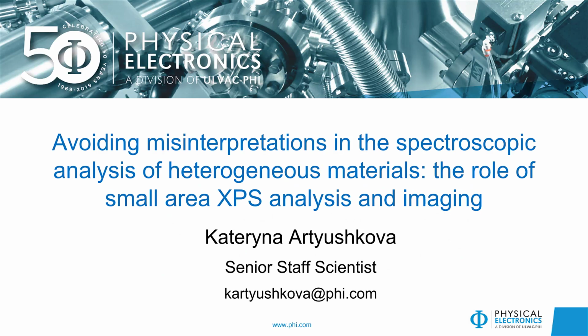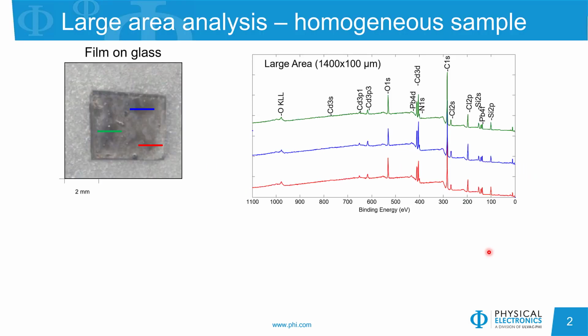Welcome to today's webinar. Today we'll be discussing challenges in analysis of heterogeneous samples, and we will focus on application of small area XPS and imaging tools for addressing those challenges. First, I would like to share with you a few examples that introduce the challenges.